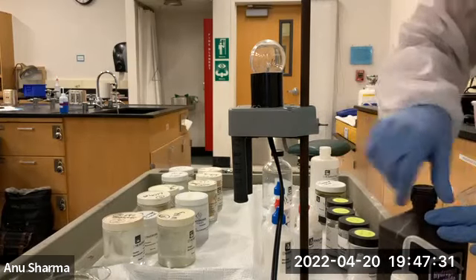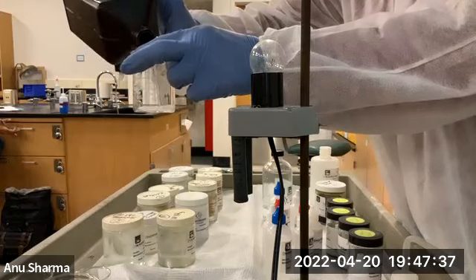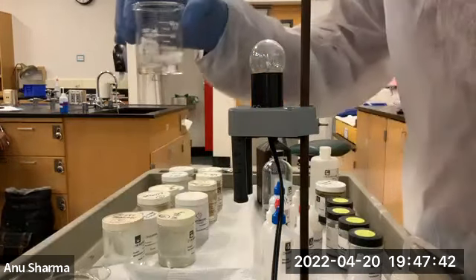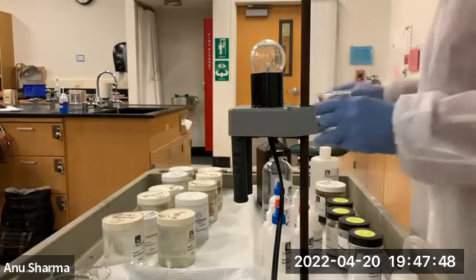So let me pour hydrogen peroxide. Here's the hydrogen peroxide. Nice clear solution, right? Now add water.